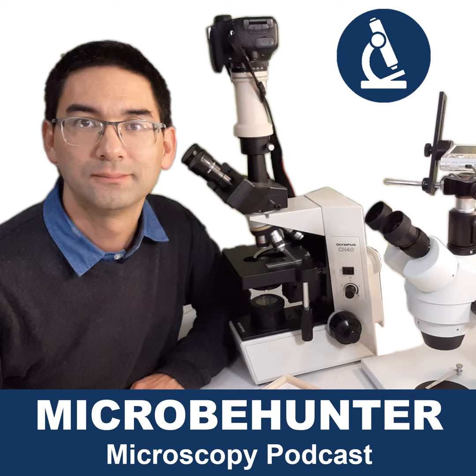Let me explain what these things mean first, and then later I'd like to talk a little bit about how this is relevant or not so relevant for amateur microscopists. Basically, it's like this. Every microscope has an objective and an eyepiece. In the 160mm standard, the 160mm refers to the distance between the specimen and the point where the objective makes an image.